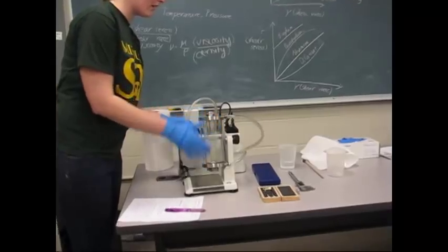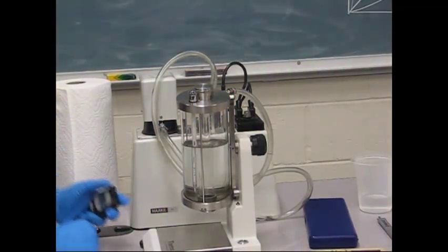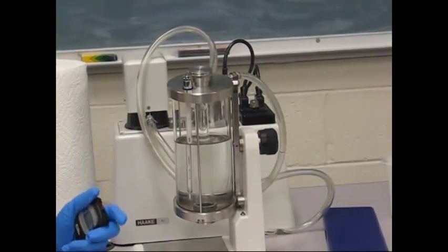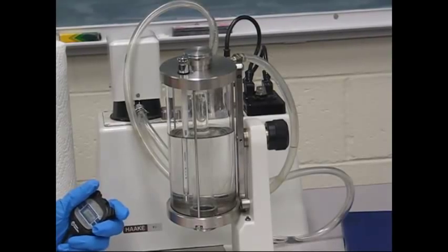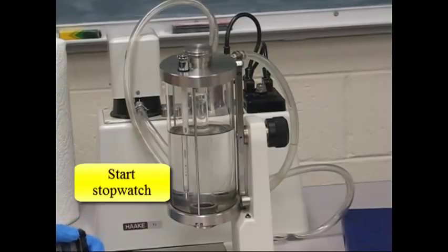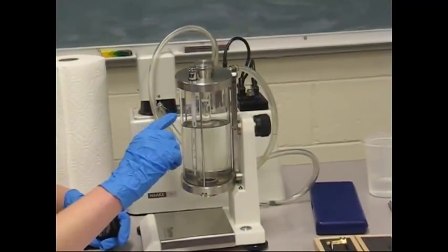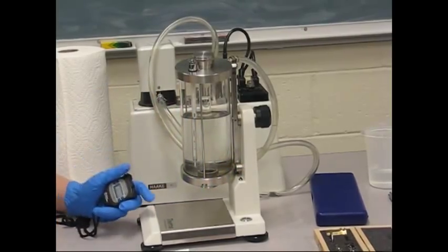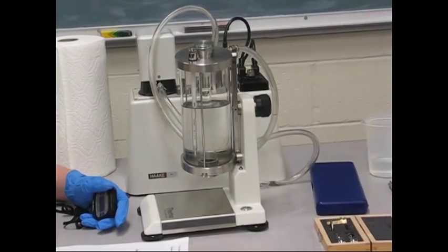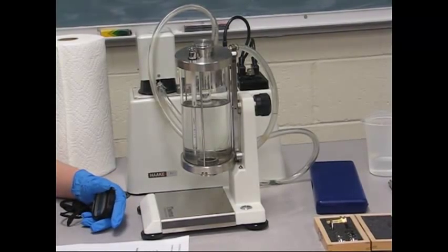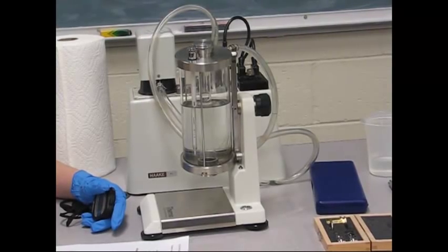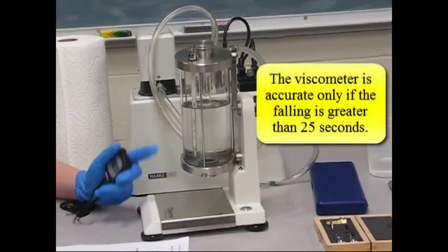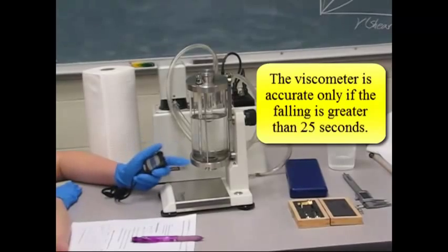So we're going to flip the viscometer, and we're going to watch it as it crosses the line. When it crosses the line, start the stopwatch. You can choose to start the stopwatch when the bottom of the ball crosses the line, when the middle of the ball crosses the line, or when the top of the ball crosses the line. Just be sure you're consistent when you start and stop the stopwatch. And remember that this falling ball viscometer is only accurate if the falling time is greater than 25 seconds.